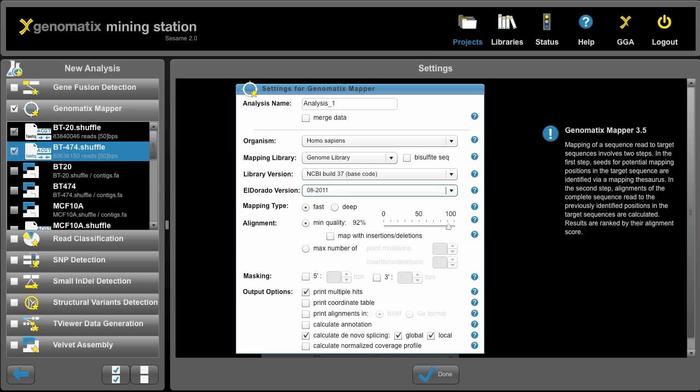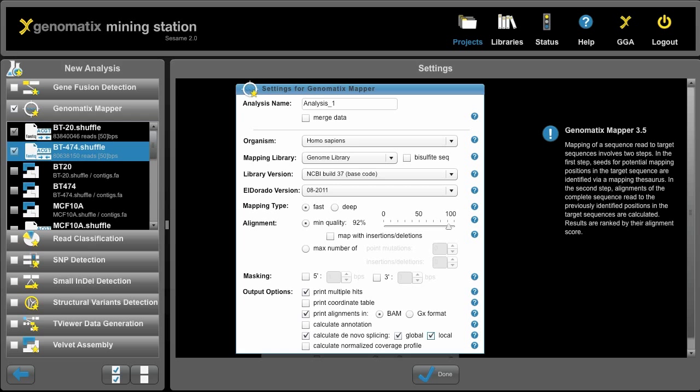Down here we can select different parameters that determine the mapping quality. We can say that the alignments are to be printed in BAM format and here we can tell the mapper to calculate de novo splicing, both in global and in a local manner. The global one will allow us to pick up gene fusions, splicing reads between different chromosomes for example, and the local spliced alignment will allow to map long reads among multiple exons. To start the mapping we simply click on done.